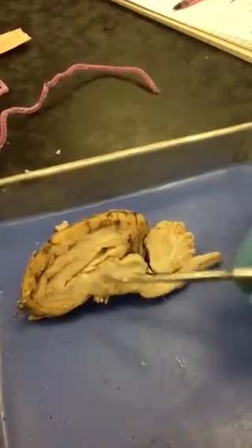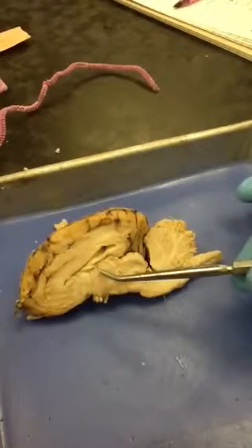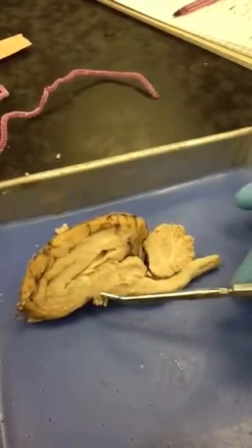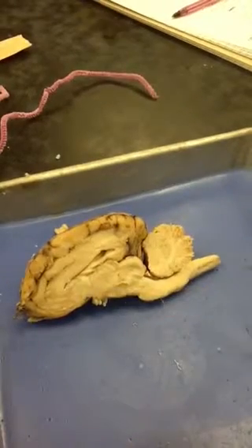Okay, and next, I'm going out on a limb. This is the thalamus area, and then the hypothalamus area. The thalamus is the relay station for all senses except the olfactory, or smell, and the hypothalamus is in charge of the autonomic nervous system and the endocrine system.